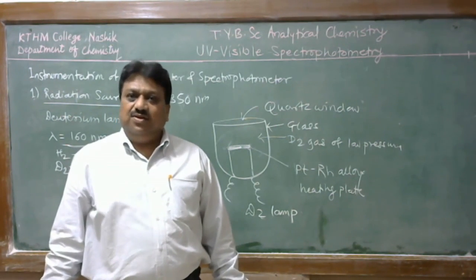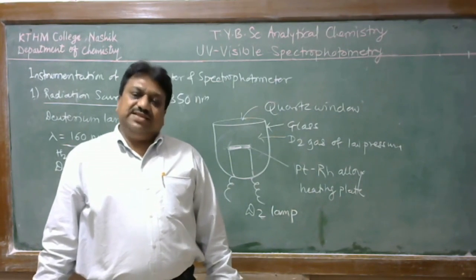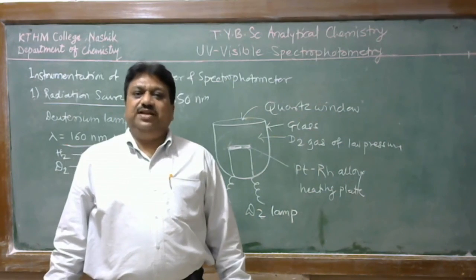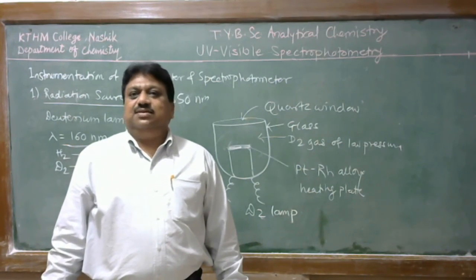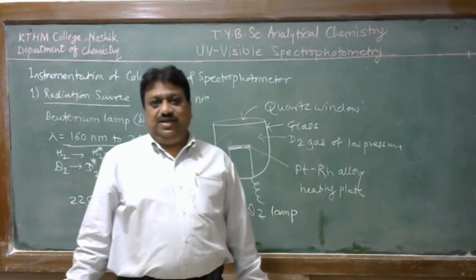With this, we stop here. Next time we discuss the wavelength selector used in spectrophotometry, the types of wavelength selector. Then we discuss the sample set and further instrumentation.